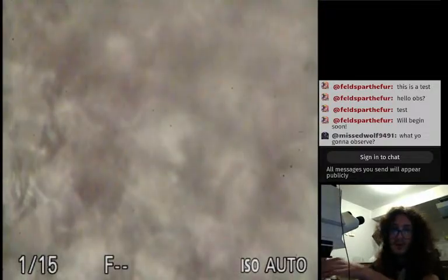No, it's not a creature. Maybe we could get some good views. Little guys. I might want to get some dye for this actually. There we go.